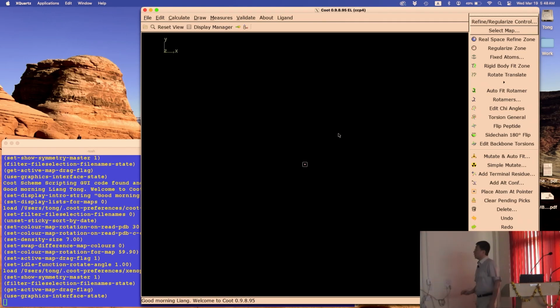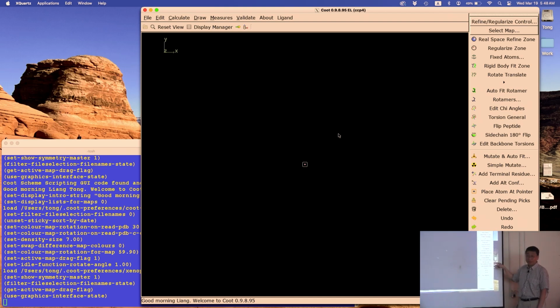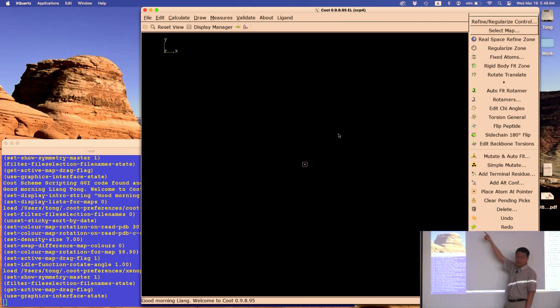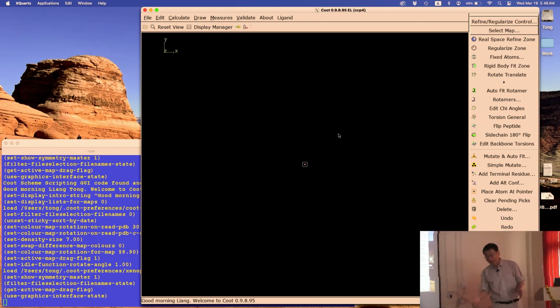All right, so everyone should have a menu bar on the right with text, okay? Not just an icon, with text. And then the menu bar on top should also have text. So everybody good? Yes. Thank you. Speak up, please, because otherwise I don't know where you are.